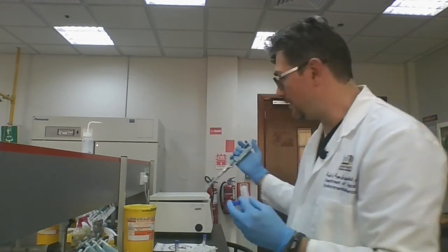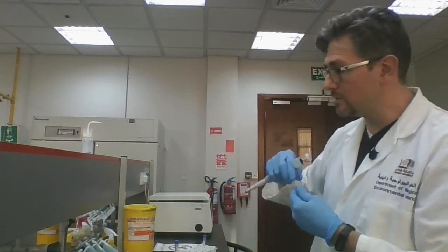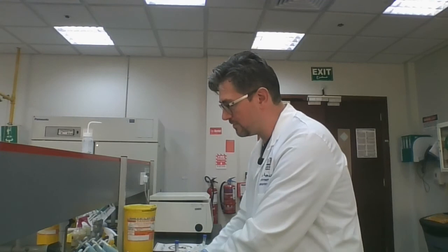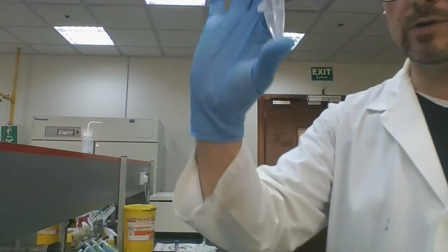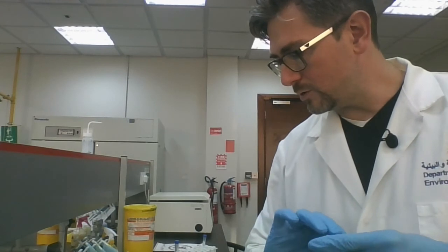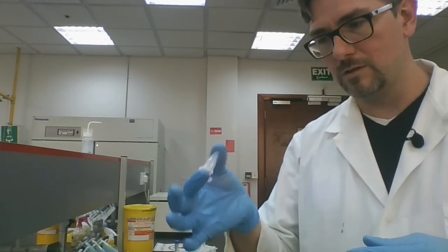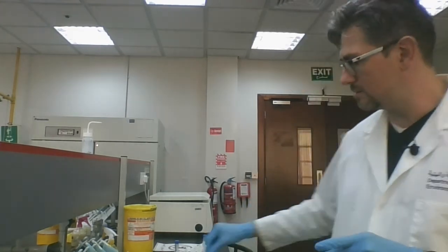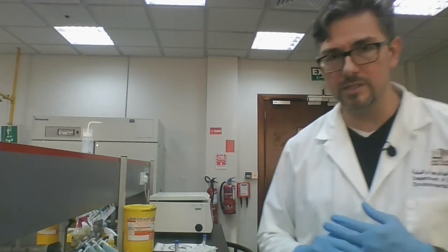Okay. So I have now added my ethanol. So the concentration of ethanol inside of these epitubes is close to about 70% right now. Okay, so what we have in here now is our aqueous phase plus ethanol. And so what we're going to do now is just basically mix them. So just invert a couple of times gently and just leave them at room temperature for a couple of minutes. Okay. And then after that, we're going to spin these solutions down to precipitate all of our DNA.